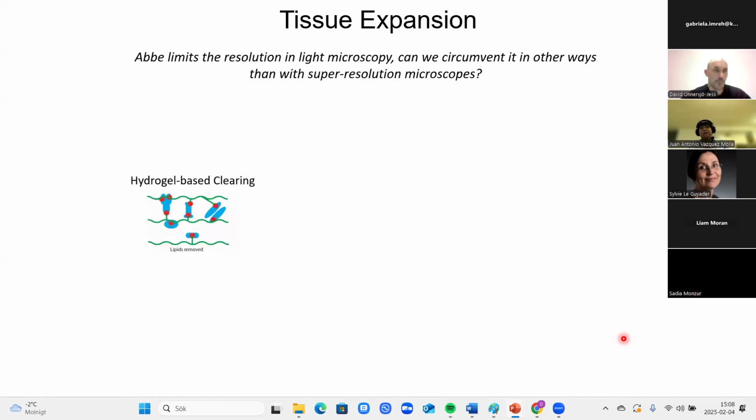In regards to the concentration, by your experience, when you say that the concentration has to be high, but you have one concentration that works in normal histology, how many times higher? Like twice, thrice the concentration? A factor of 10, I would say. So you will go by 10. Yeah, so 1:100 exactly. Okay, thank you. That's a good starting point at least.